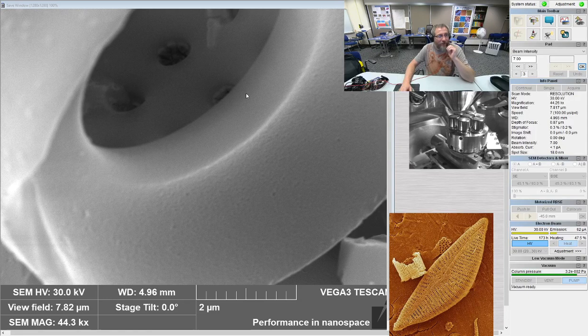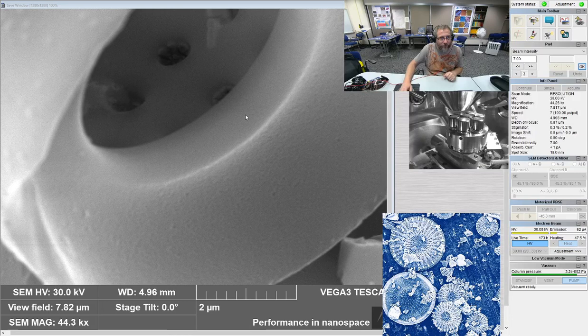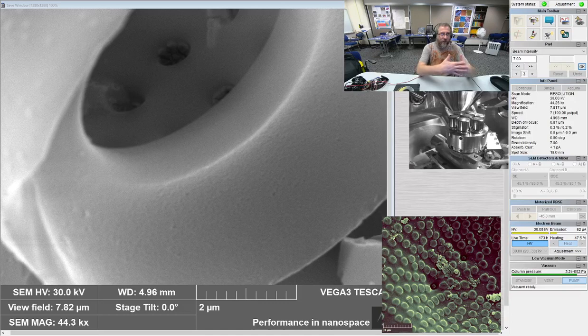Yeah, and I think the inside covering and the outside covering aren't completely independent, but they fan out internally into a more sheet-like structure, right? Do these have a chamber between the two, like a Stephanodiscus has an inside covering and outside covering, or is it one big thing? I don't know if they're loculate. We could try to find a broken one and see whether it has two pore covers, one on the inside and one on the outside, or whether the pore cover is just halfway between inside and outside, which is what I think is going on here, but I'm not sure.